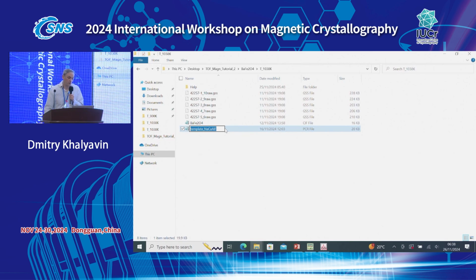Because in a few months, if you start looking at this data, we may not understand what we have done. So put as much information in the title as you can. At least chemical composition and temperature. That will simplify your life in future.